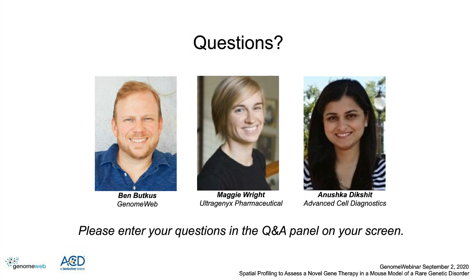The next question, why was PBS used as a control over an empty vector? Yeah, so we used PBS instead of an empty vector because empty vectors themselves can be toxic. Cells don't like to be administered vector that doesn't have anything in it, and to make sure that what we were seeing was a true result of our vector, which was full of the DNA that we were delivering, we wanted to make sure that we were using something that was not going to be toxic in and of itself.